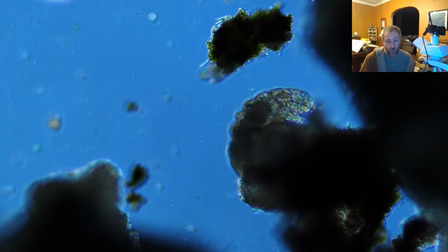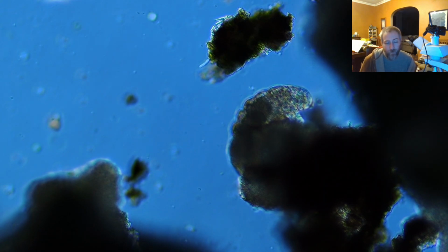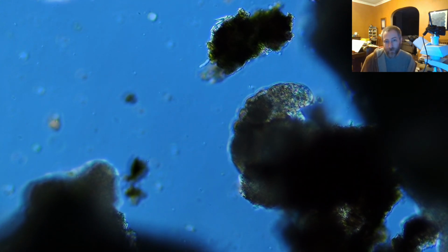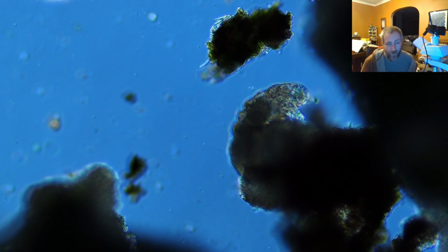Now, more appropriately, some of those water bears that live in those really cold places, like just on the surface of little puddles and glaciers, are adapted to those environments, and they're actually living in them when they're in a water environment. When it freezes, when it goes back to ice, they don't move around, but they actually don't become active unless the temperatures are down to a certain degree, because they actually like living and being active in really cold conditions. Otherwise, why would they be living in Antarctica, where basically it would never get warm enough for them to really be active?